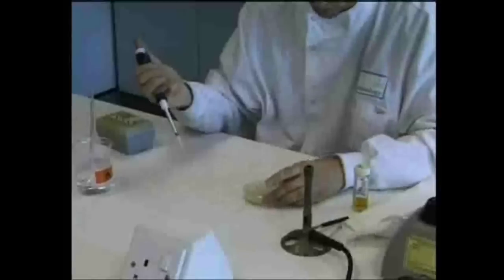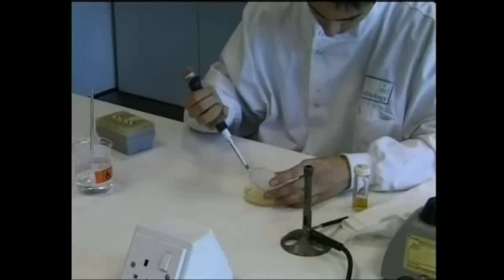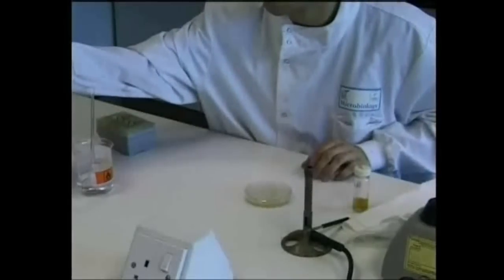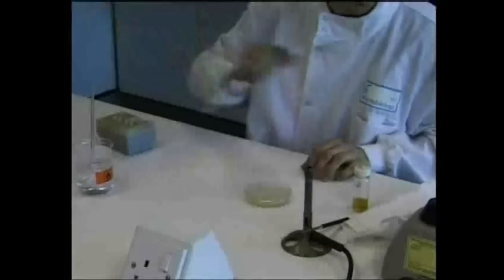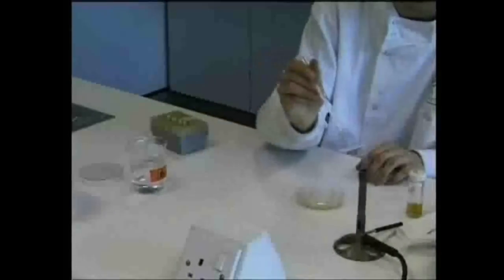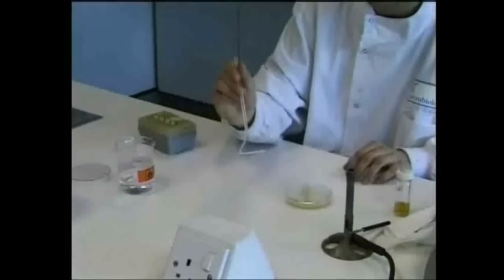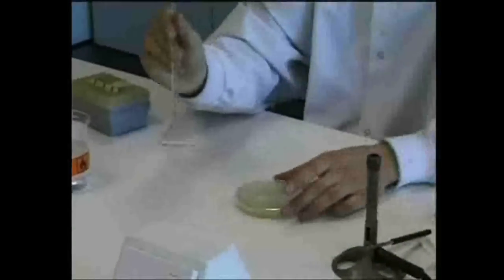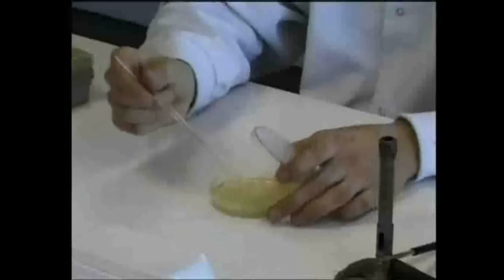The neck of the culture bottle is then reflamed and the lid is replaced. With the lid of the Petri dish raised slightly, the culture is pipetted into the centre of the plate and the pipette is then discarded. The glass spreader is then dipped in the alcohol and flamed to sterilize it. To avoid the risk of fire, the beaker containing the alcohol should not be too near the Bunsen flame.